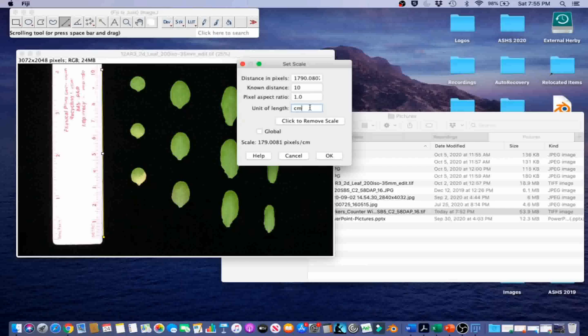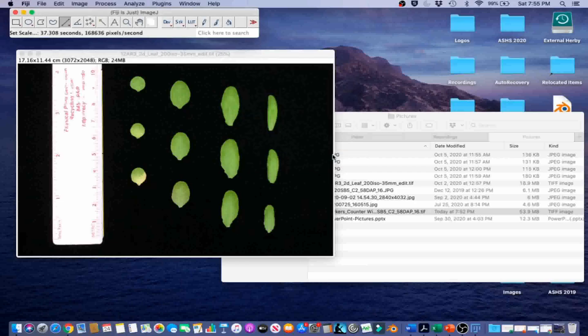We use this option when the same image needs to be imported multiple times to perform different sets of image analysis, or when all images in a set have the same scale. In this case, this is the only image with this scale, and set scale must be done again for subsequent images. So we are just going to go ahead and click OK with the global unchecked.